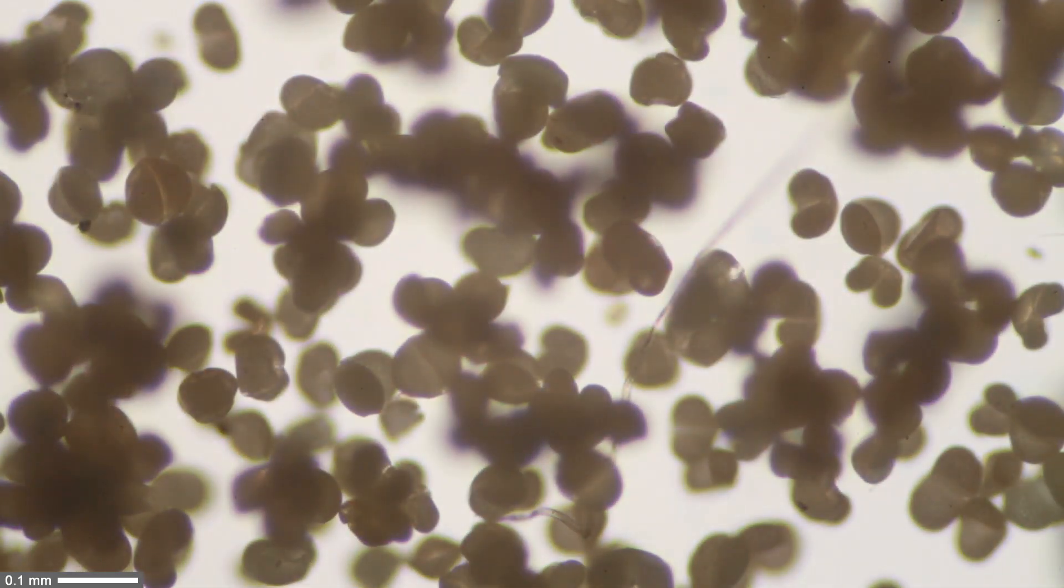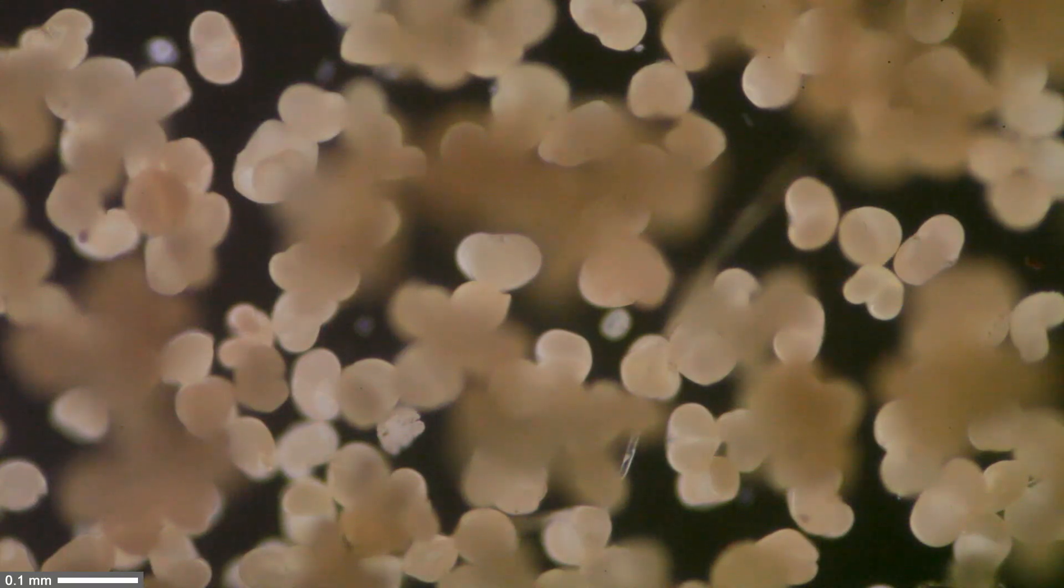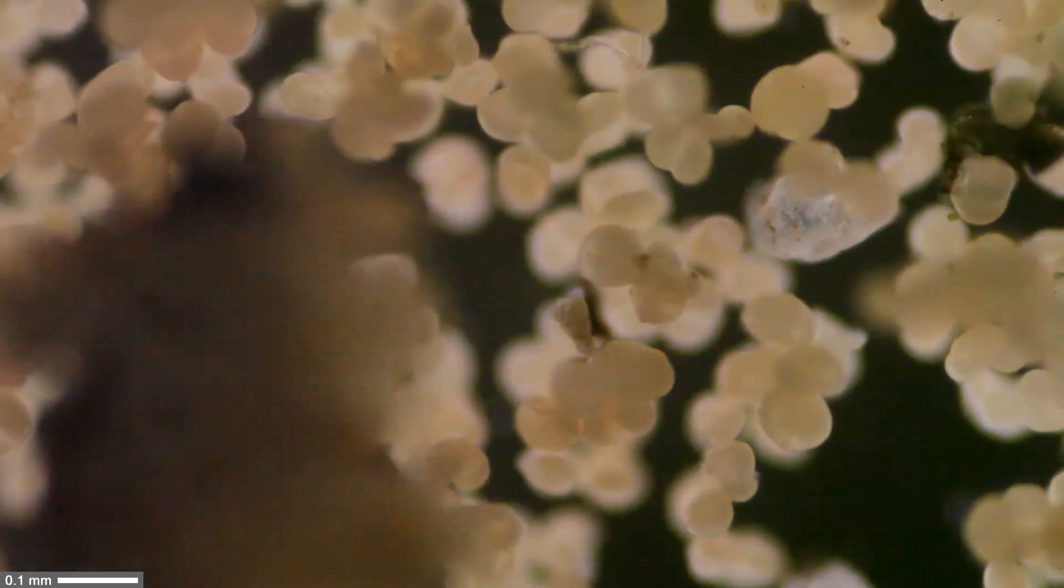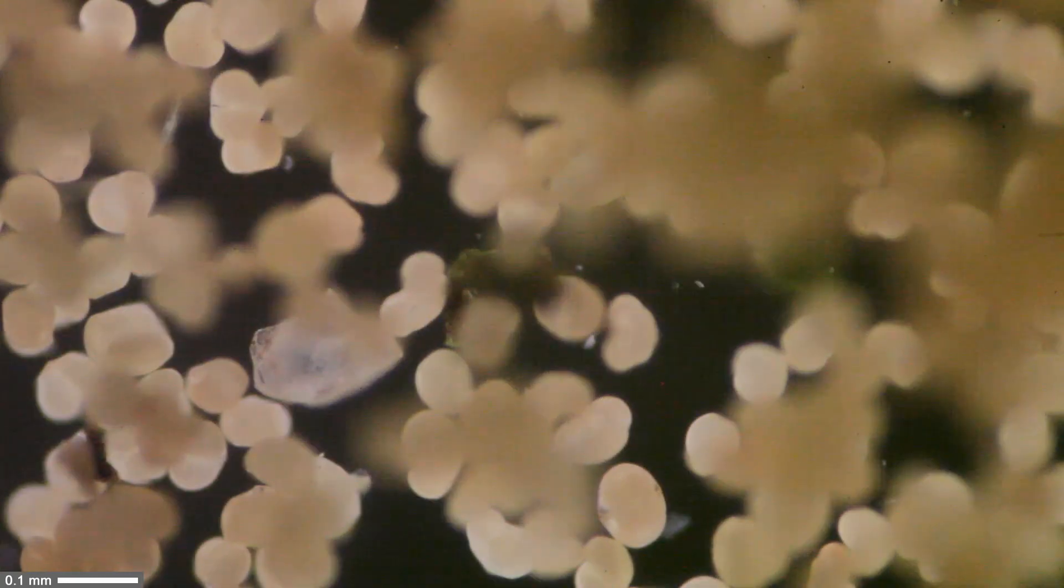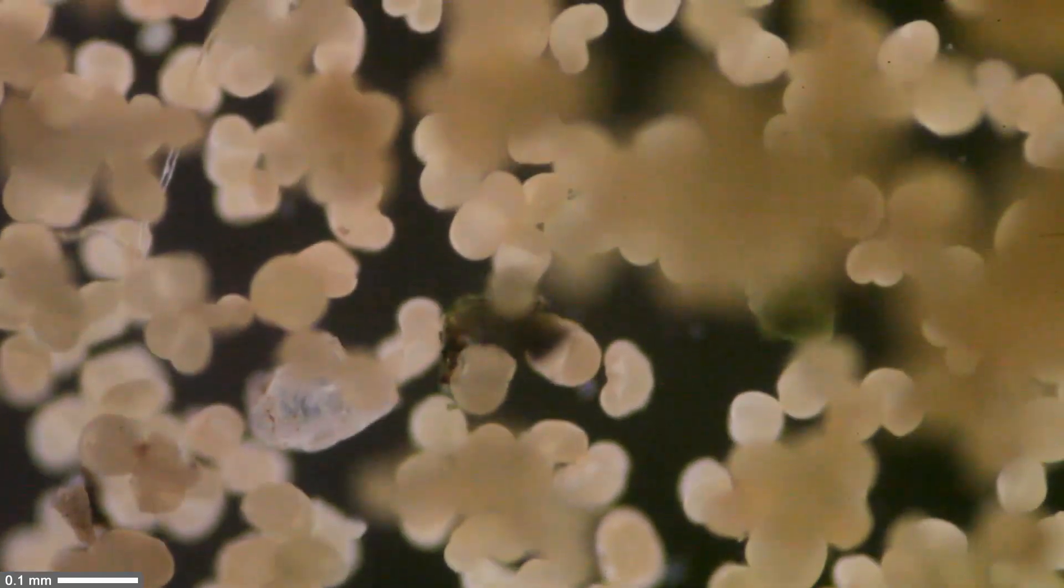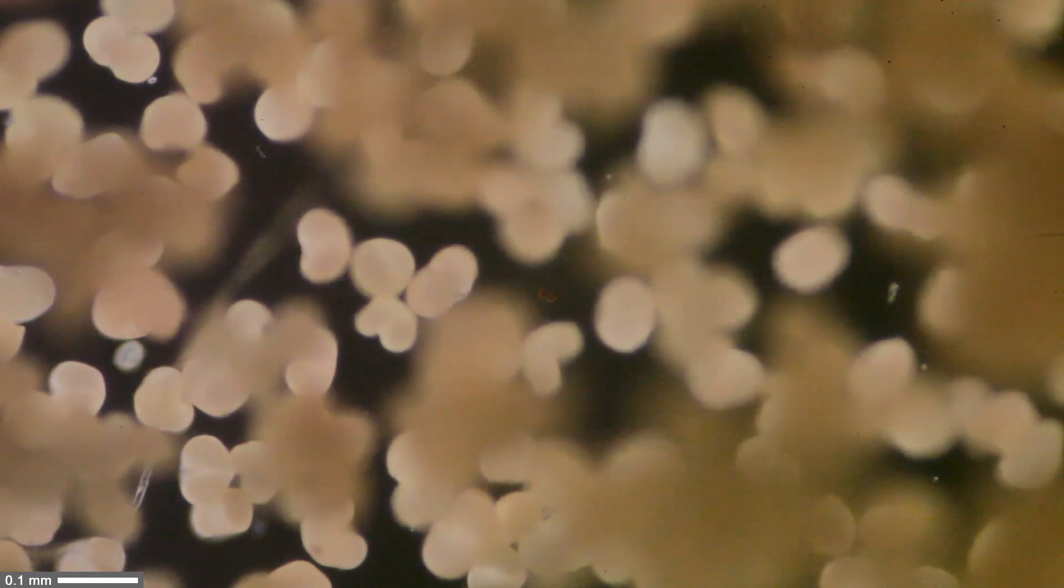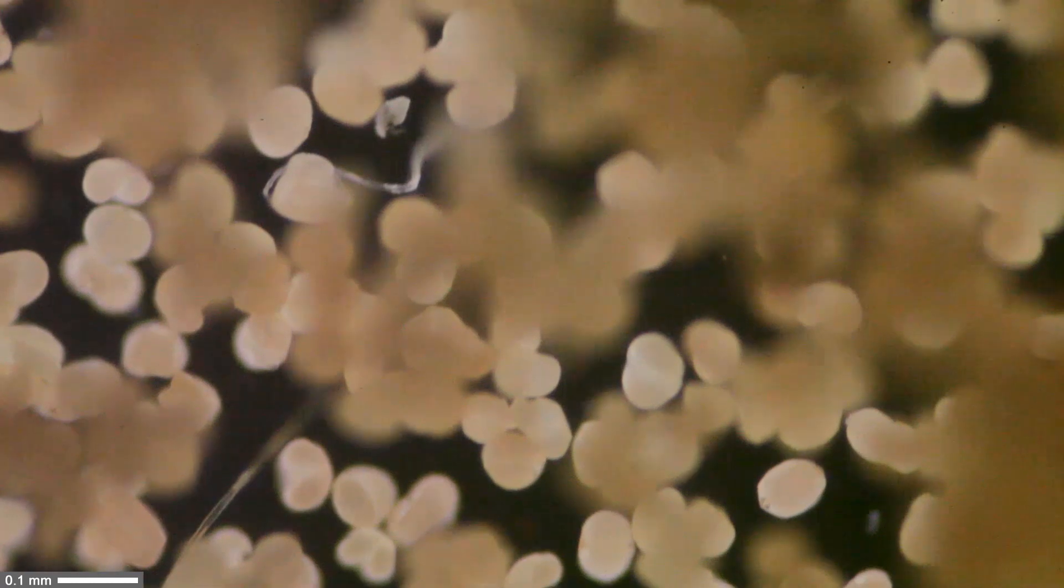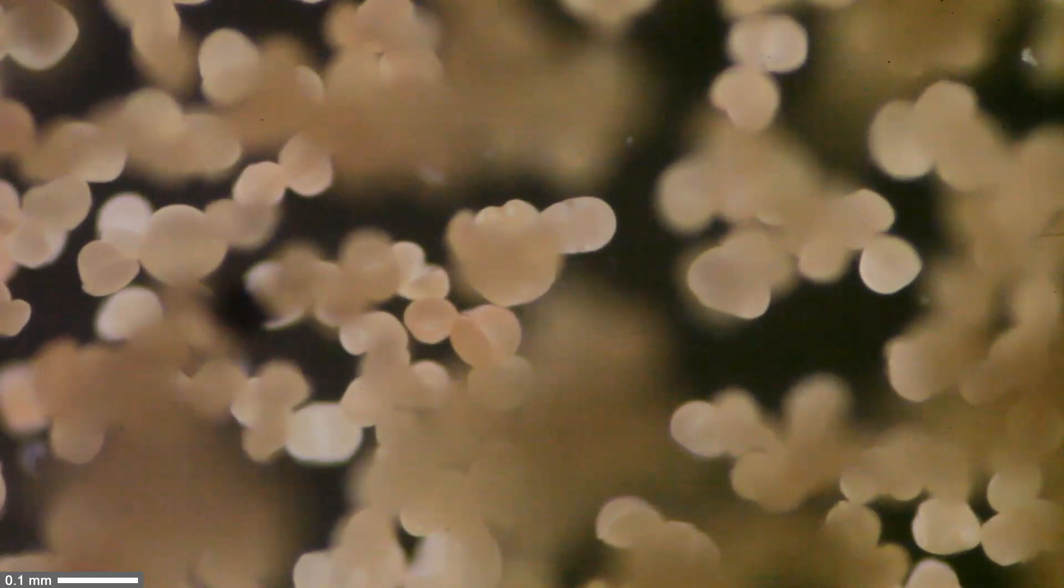This is now at the same magnification using a dark field patch stop. The pollen appear bright on dark background, which is a nice contrasting technique. You can still see that there's not only pollen but also some contaminants because I collected everything from the street, but that's okay.